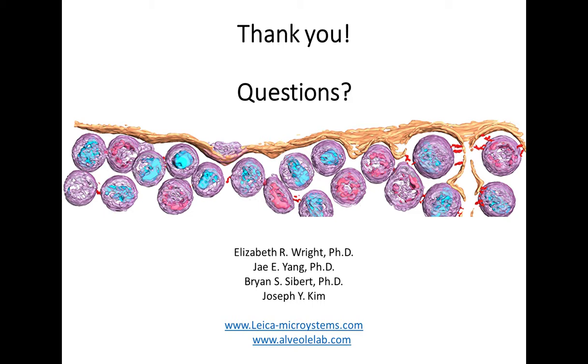Thank you. This is an excellent question. At present, we believe there is a great variety of cells that can be micropatterned onto the EM grid. The success of such specific cell type would depend on optimizing the pattern along with finding the appropriate extracellular matrix type as well as the concentration. As a matter of fact, we have recently begun to micropattern EM grids for trickier cell types, such as astrocyte-like cell lines, as well as primary neurons.